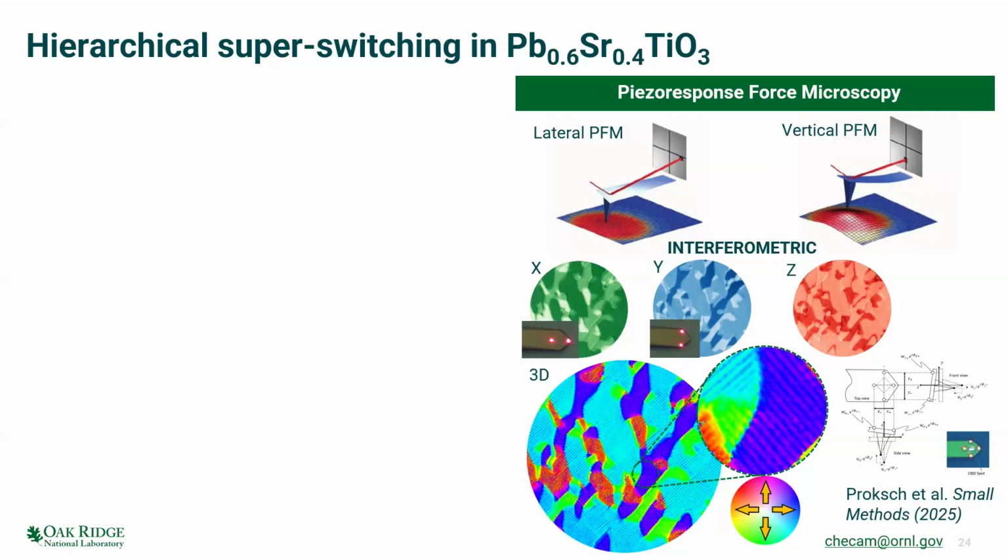So this has a lot less noise, but also it's quantitative, right? So you can know exactly how many nanometers or picometers you're moving your tip up and down.